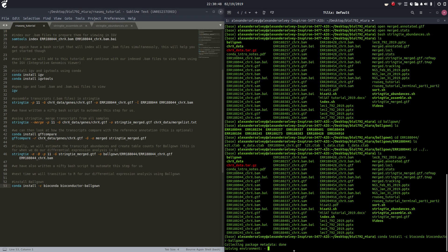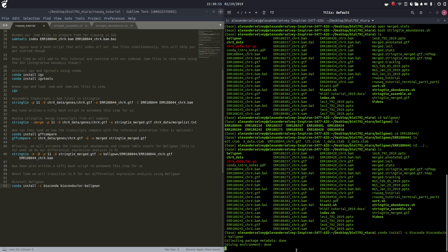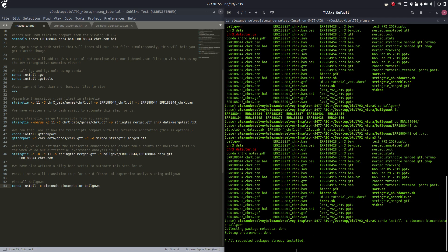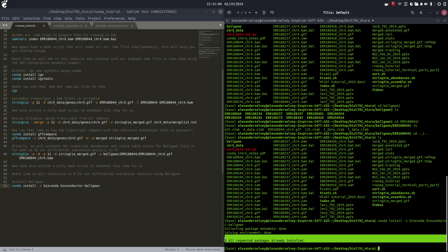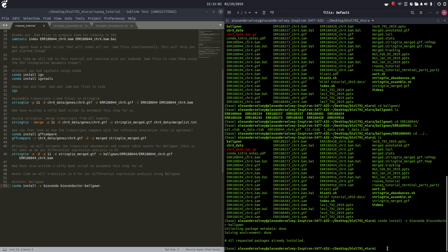It collected the metadata, solved the environment, and done. All the requested packages have already been installed.